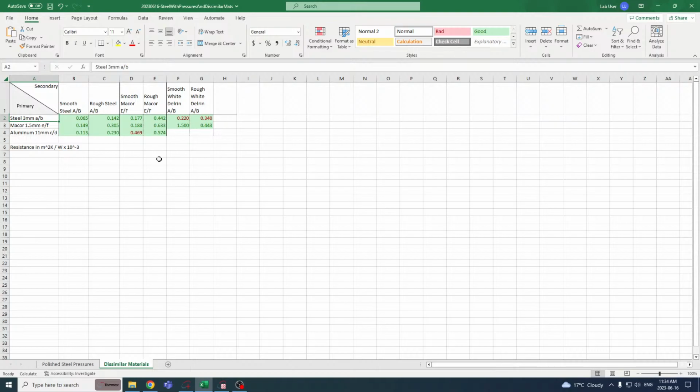We've done a lot of these measurements and provided that data, which has been of great value to increasing the certainty of the thermal simulations that the data is used in.